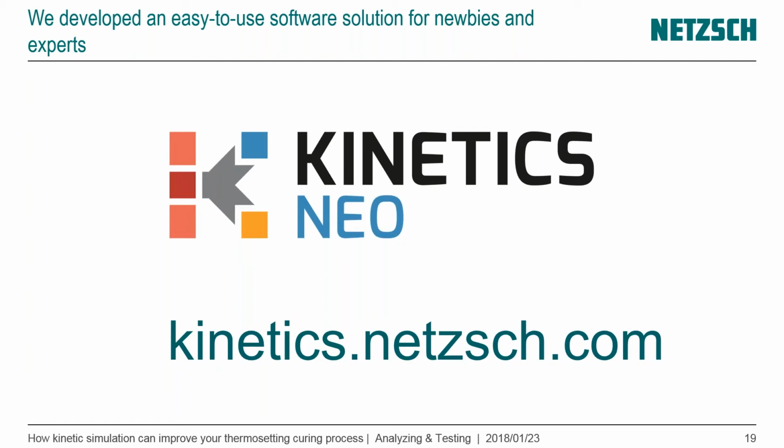Okay, one last question from Dami Kim. To conclude this, you are saying that I should fix the Avrami exponent to calculate activation energy, nucleation rate, and so on. How could I select a certain Avrami exponent? I'm thinking that I may choose an Avrami exponent by observation of microstructure, which provides the information of dimension of evolution. Is this right? Yes, the Avrami exponent depends on the nucleation growth rate and the nucleation size.